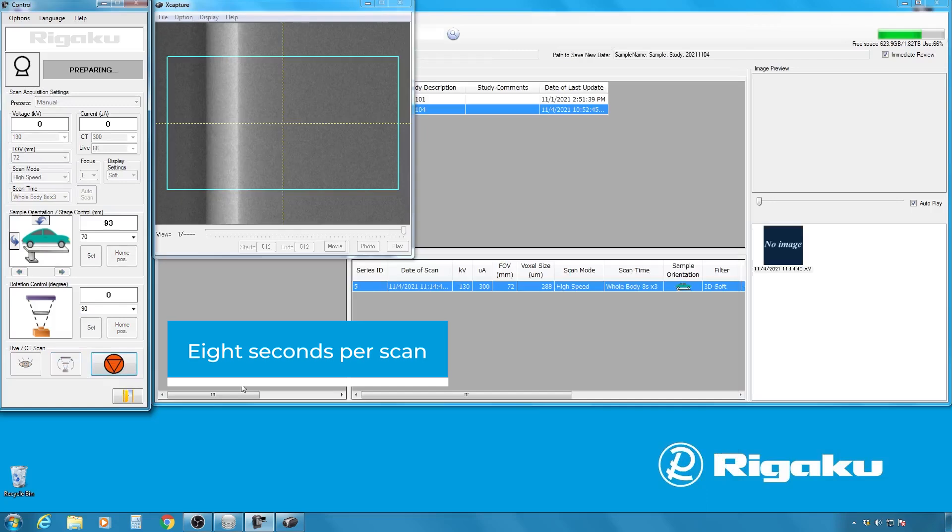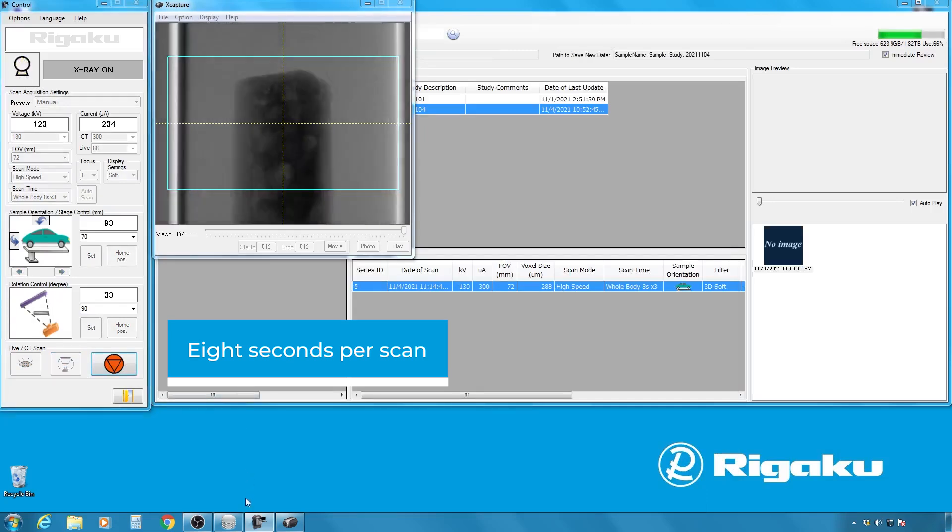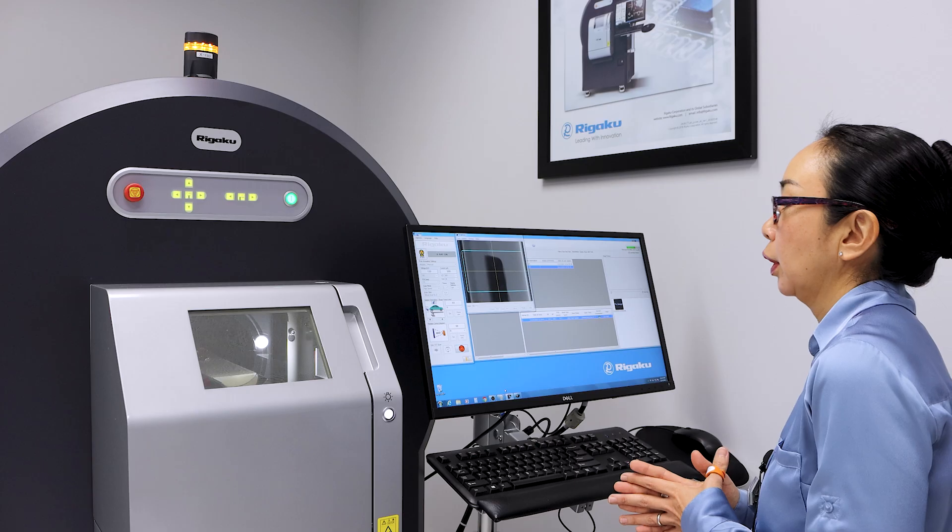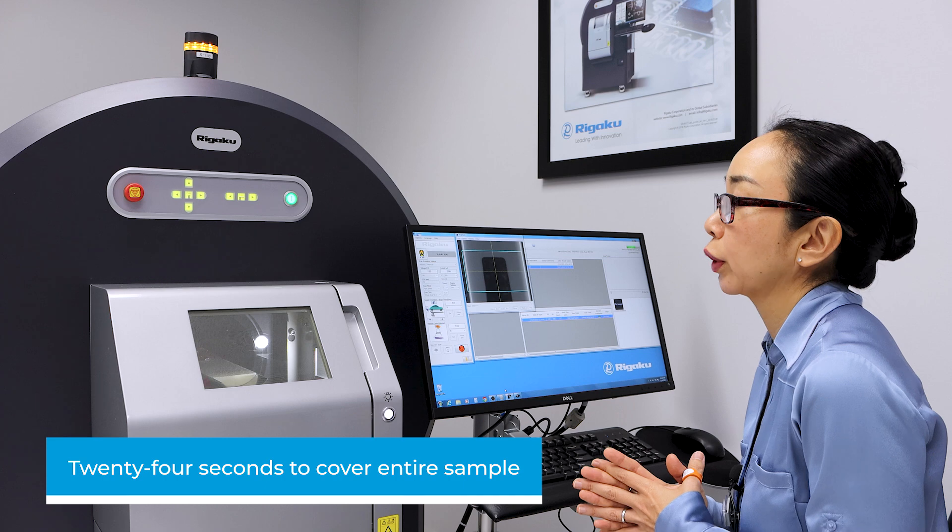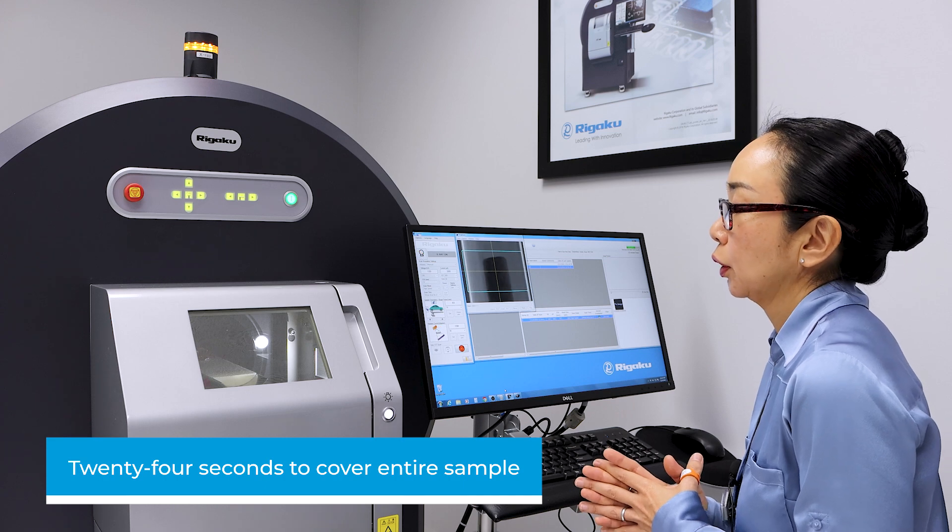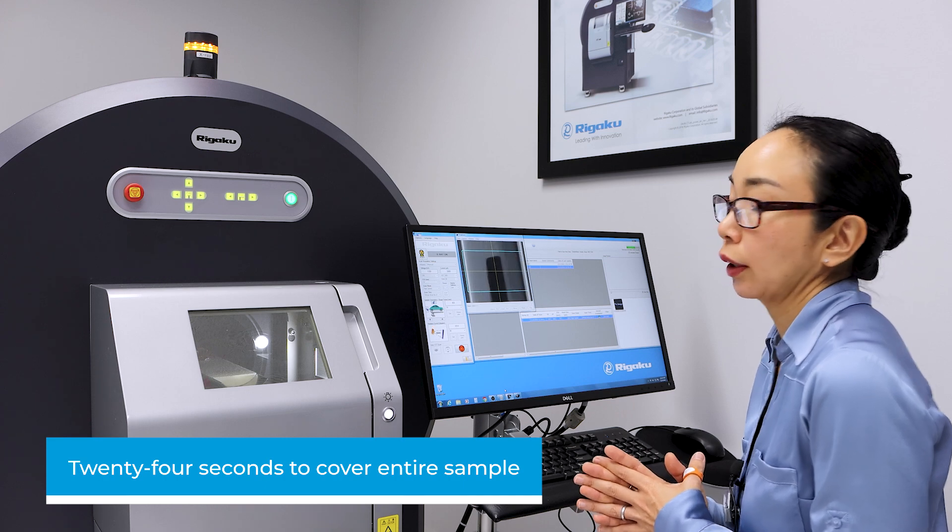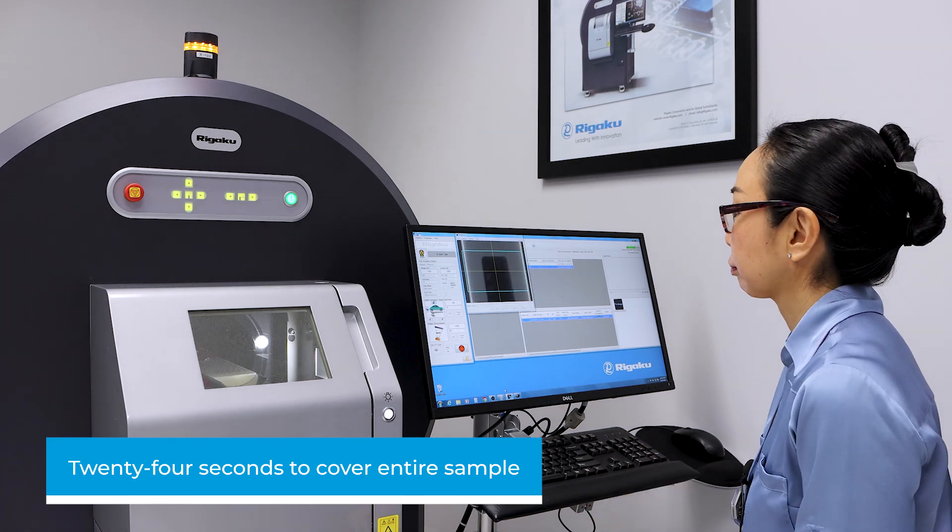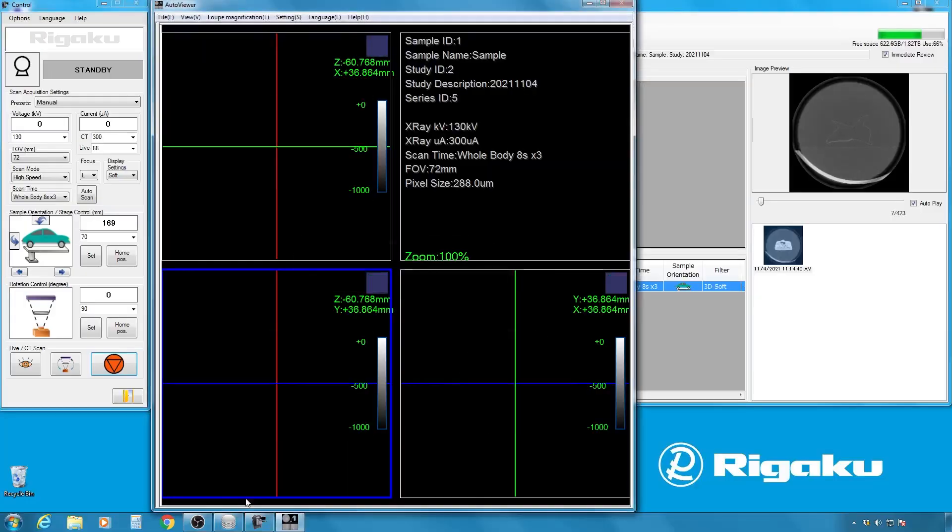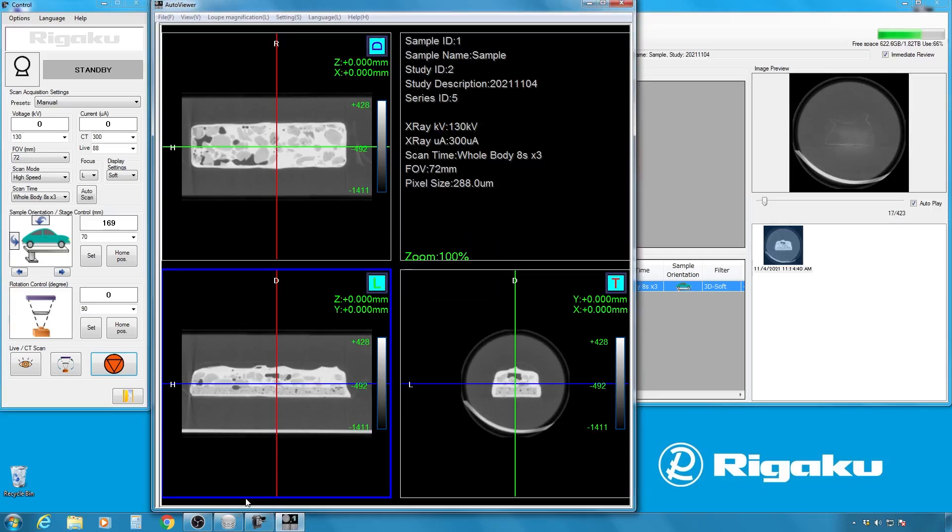And this is the eight second per scan condition. So it's going to take 24 seconds to cover the entire sample.